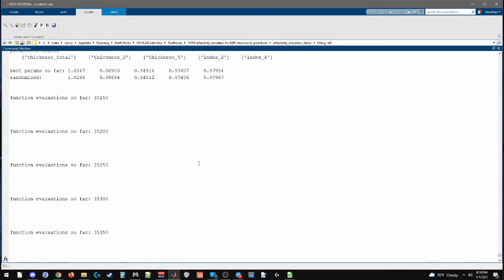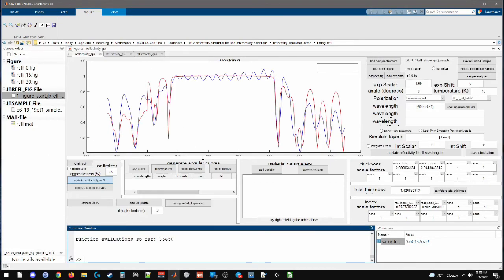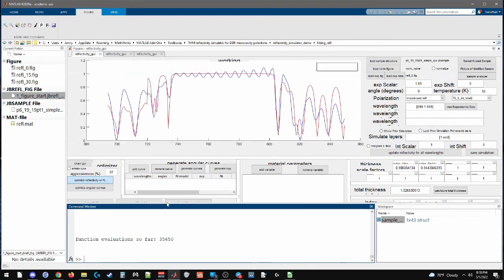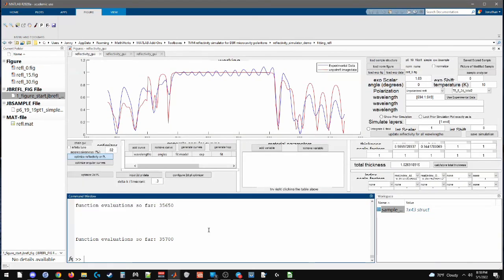So I don't want to stop the video because I want you to be able to see it happen live. But hopefully it'll only take a minute at most here, I think. It's certainly getting close.